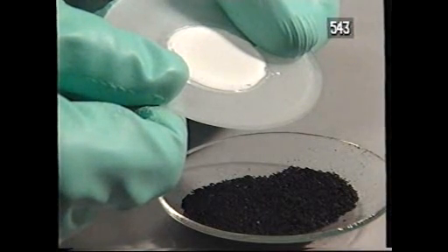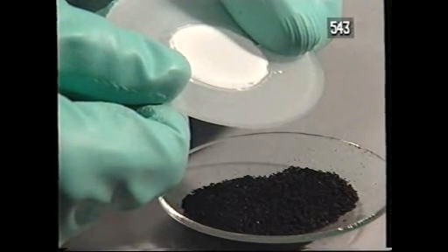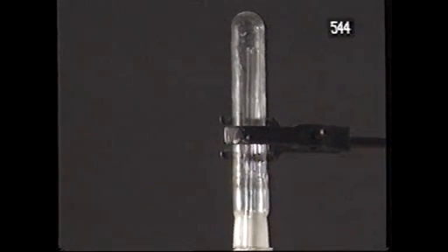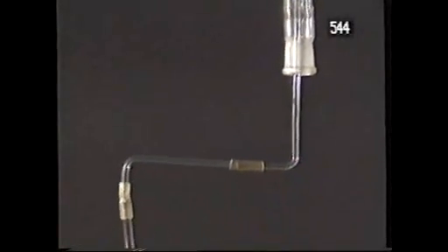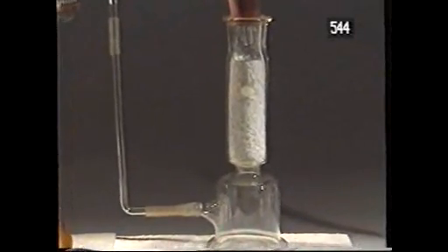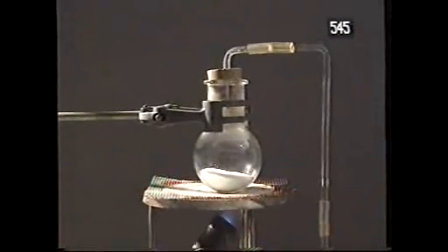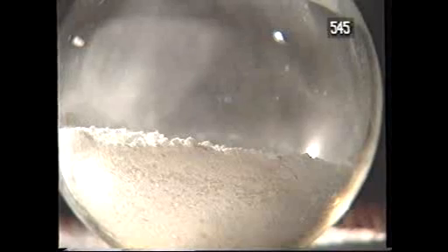I'll use it to make the promised alkaline gas, ammonia. Ammonia gas is made by heating alkalis with ammonium chloride. I'm collecting it in this tube. It's arrived at the tube by being passed upwards through this tower of quicklime, which dries it. It's come to the tower from a flask, where I'm heating a mixture of ammonium chloride with an alkali, calcium hydroxide.